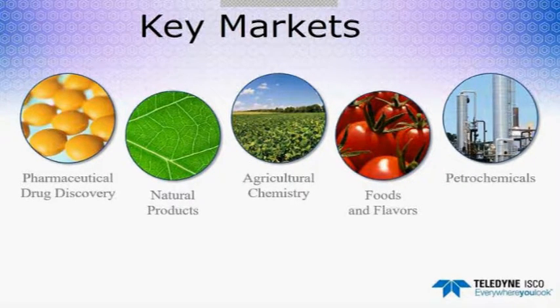Look for an application note from us sometime in the future about that, because I find that people have made the same comment, and I've worked with customers for techniques to improve the predictability of TLC plates.